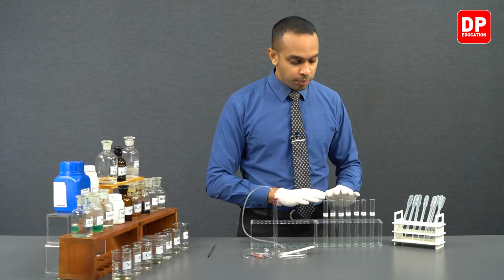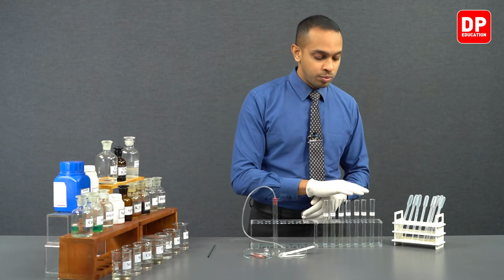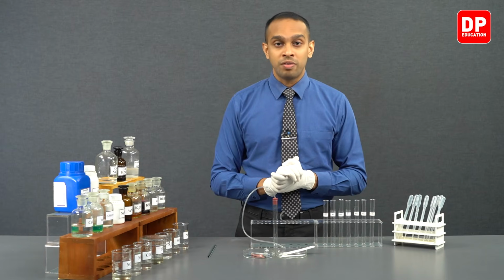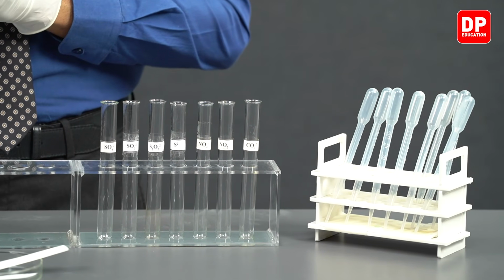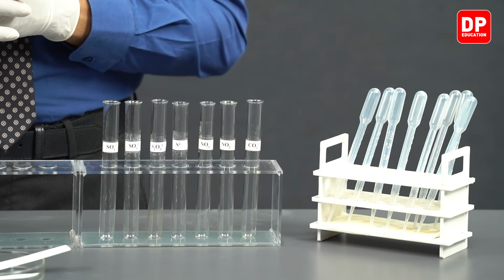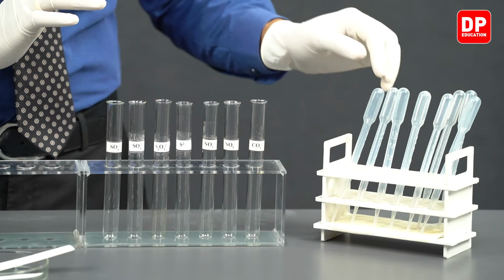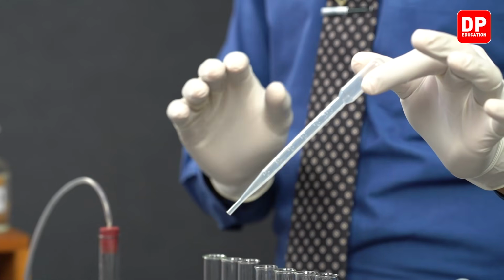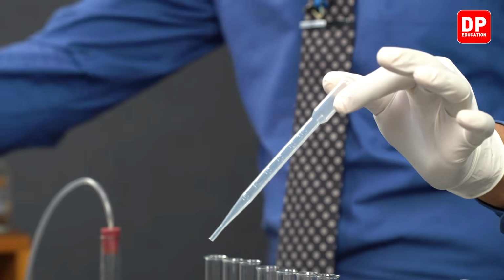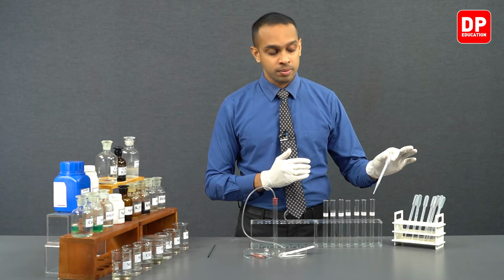Apart from that, we'll be using test tubes. You can see all of the test tubes are labeled so that we can easily identify what anion solutions are present in each of these test tubes. We'll also be using droppers. These droppers will be used to transfer small volumes of each of these solutions into our test tubes.